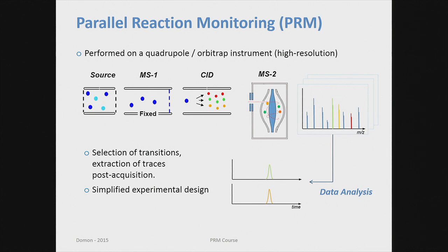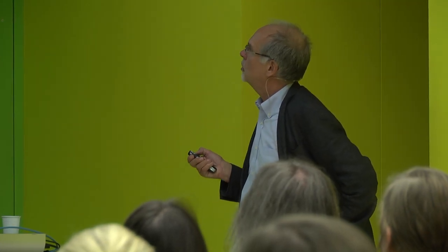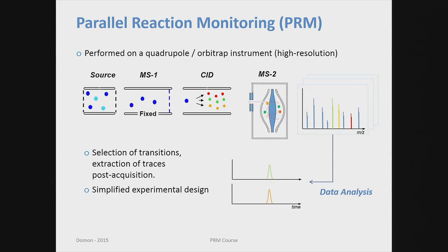So the difference here between this type of experiment and a classical, let's say, DDA experiment is that we do a targeted experiment. So we will record a full MS/MS spectrum during each cycle. That means every 2 seconds or so. So we systematically collect the data, and then we can trace the intensity over time. So we can really properly quantify.